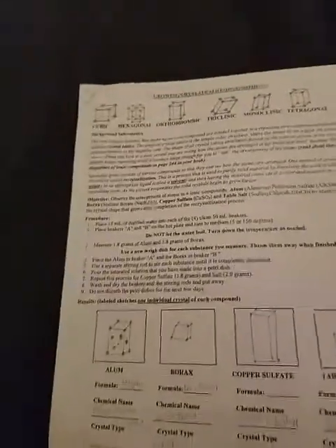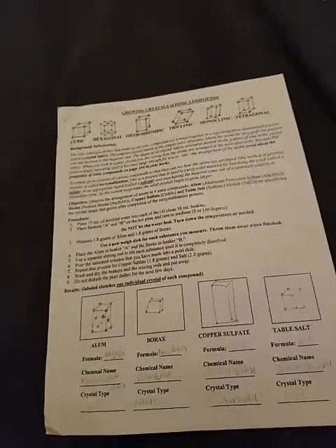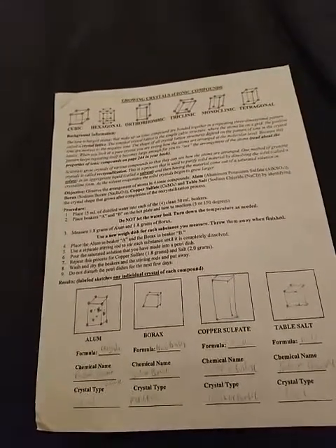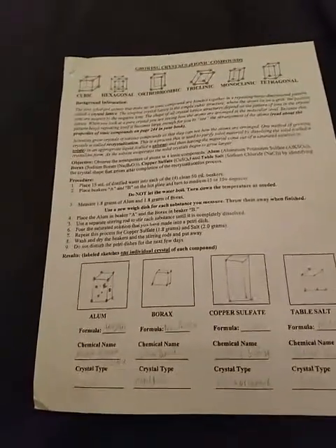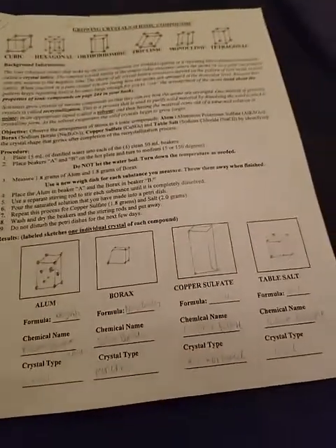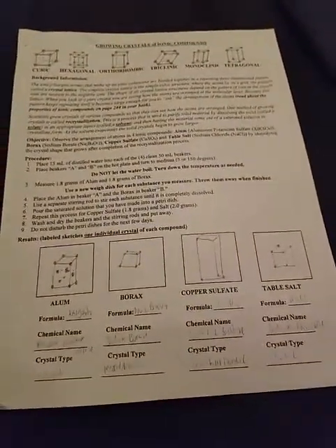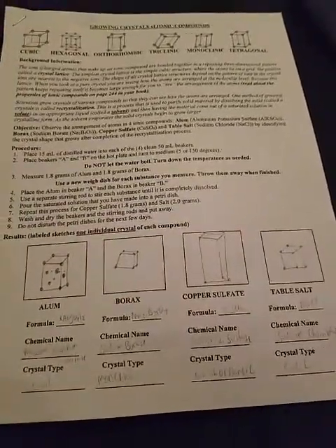So in this lab, we put different substances into different beakers with hot water, and then we stirred the substances into the water, and then we placed the mixture or the solution into a petri dish, and then we let it cool overnight so we can form crystals of alum, borax, copper sulfate, and table salt. After about a weekend of letting them evaporate and form, we came back and observed the crystals on Monday.